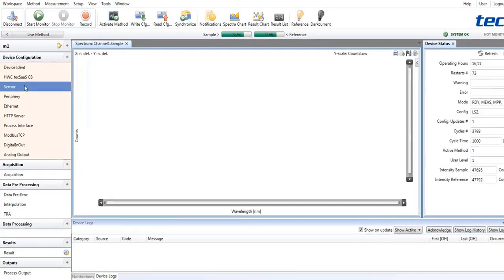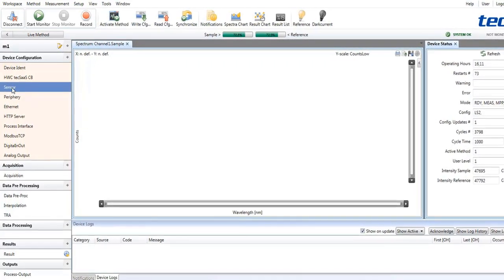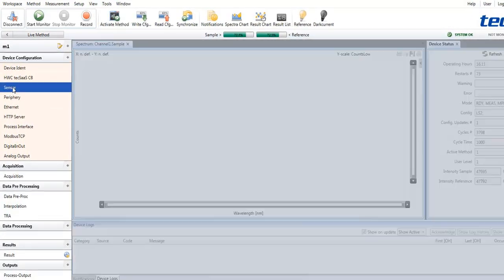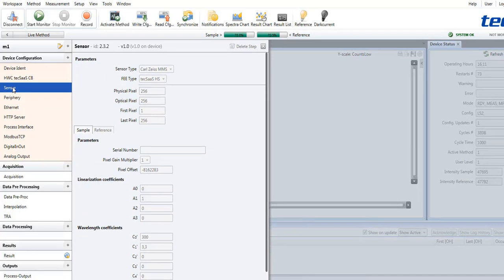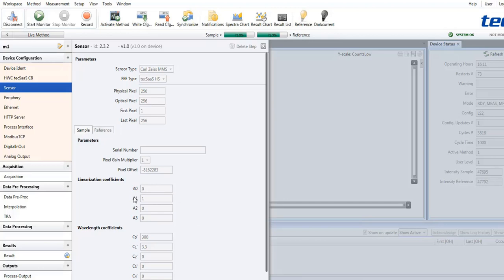As an example, you could show the sensor type, which is an MMS spectral sensor in this case, with its wavelength coefficients and linearization coefficients, the number of pixels and some more information.